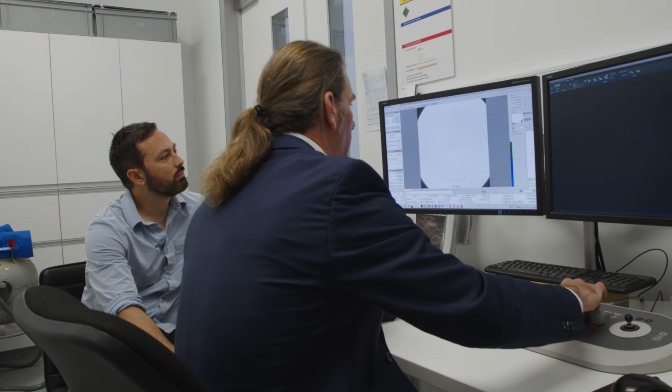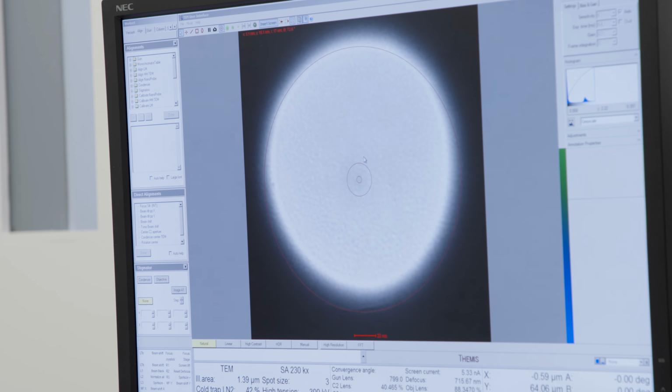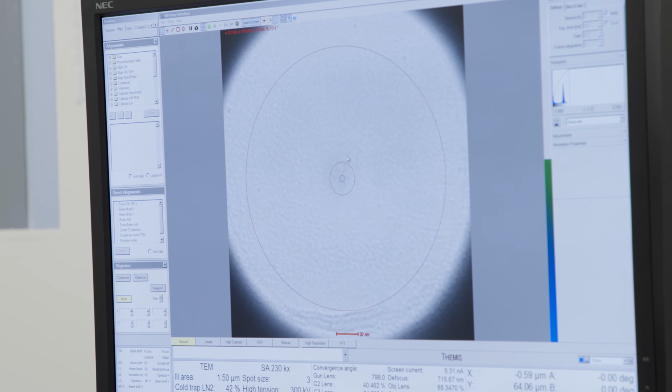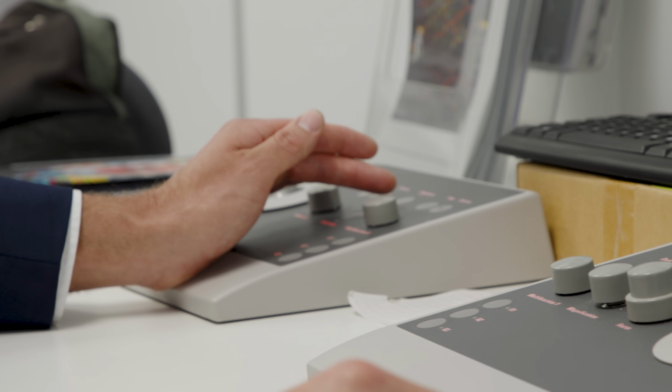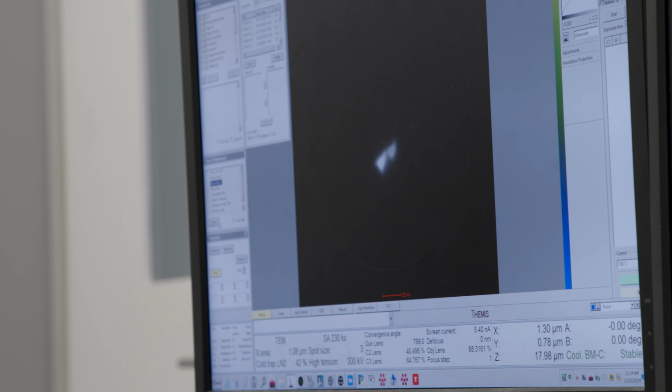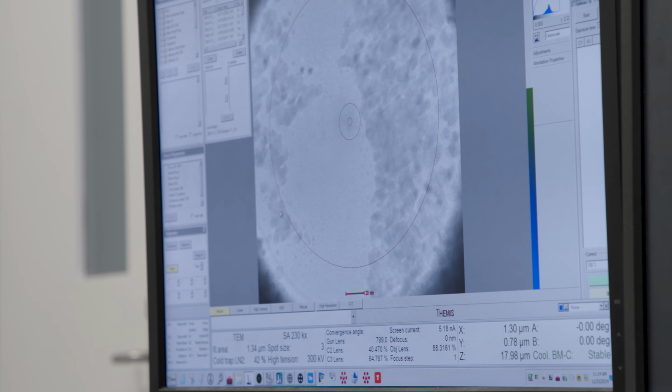Okay, now I simply go up with the magnification and I do a few more basic alignments. In this electron microscope, because it's called transmission electron microscope, the electrons always transmit the sample. Here we look through our entire sample at the same time. And that's why it's so important that we align the sample. So if you imagine atoms in a high symmetry direction are lined up like pearls on a string, when we look down it, well, we can see an image. But if we're in some random direction, then everything would be just blurred. So that's why we have to do some tilting in the end.